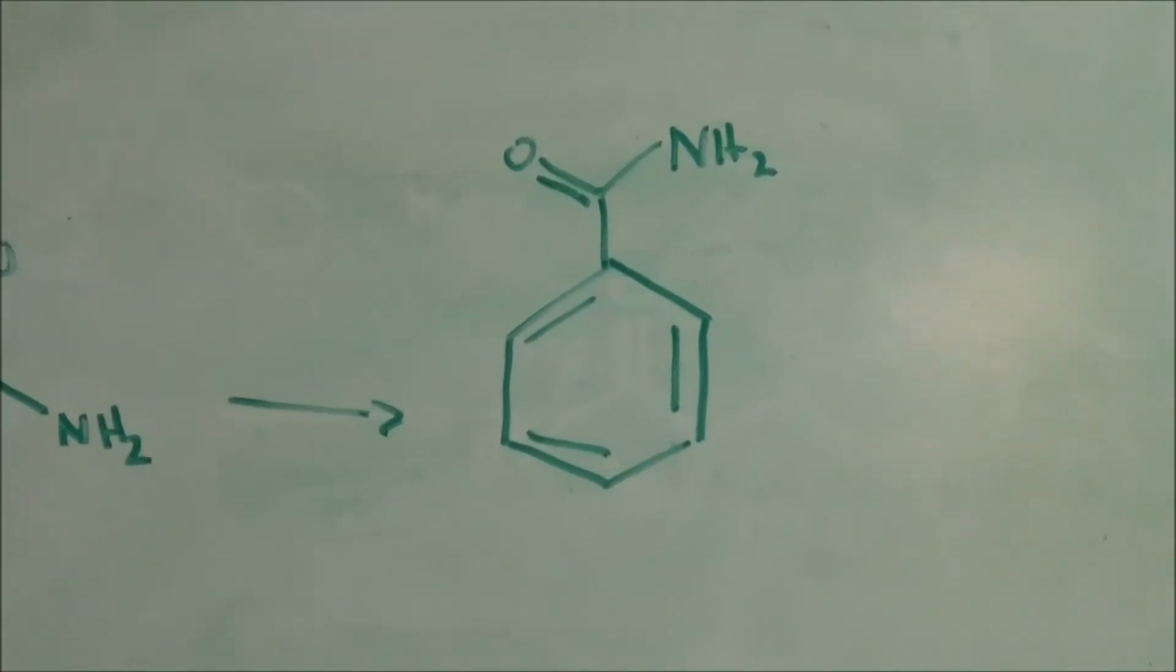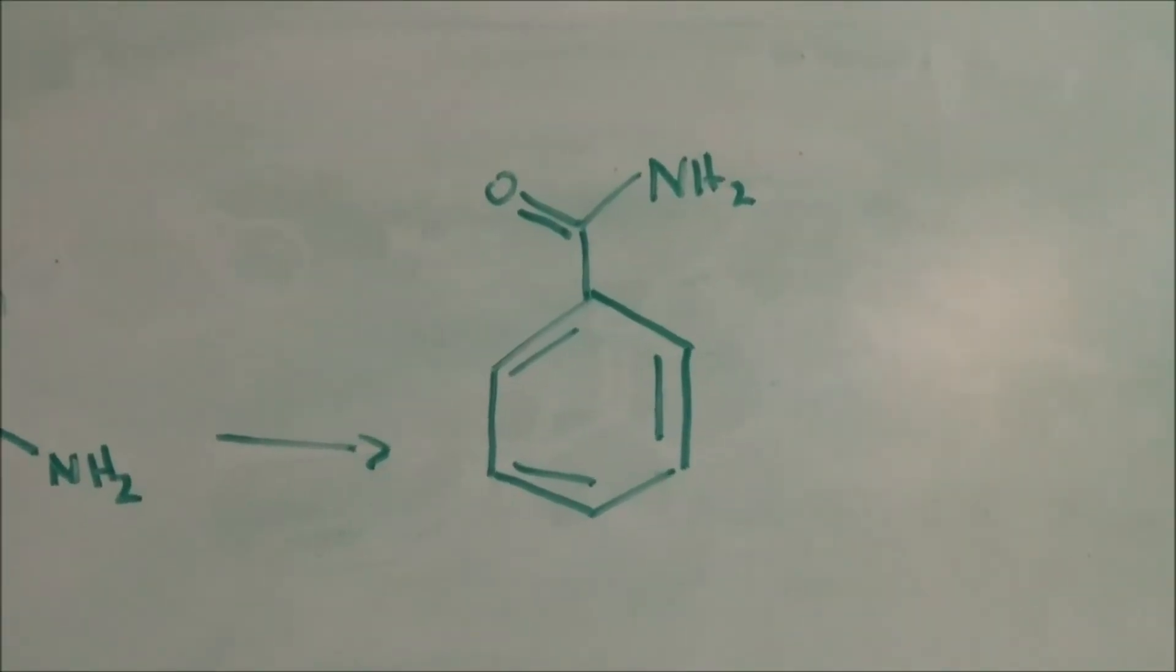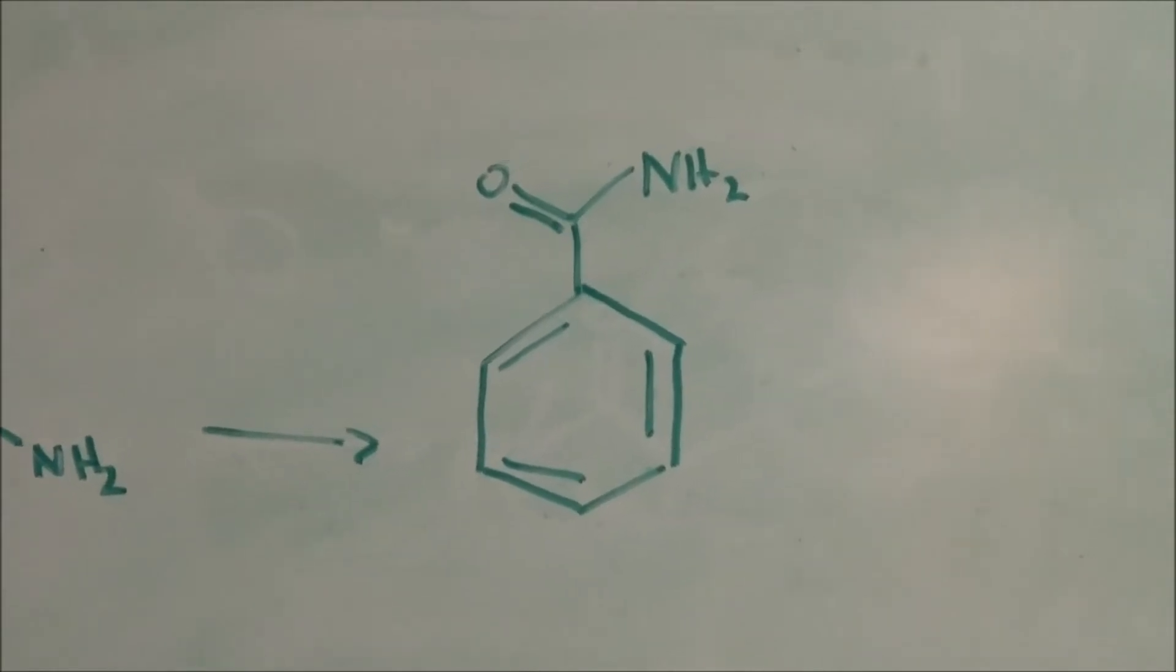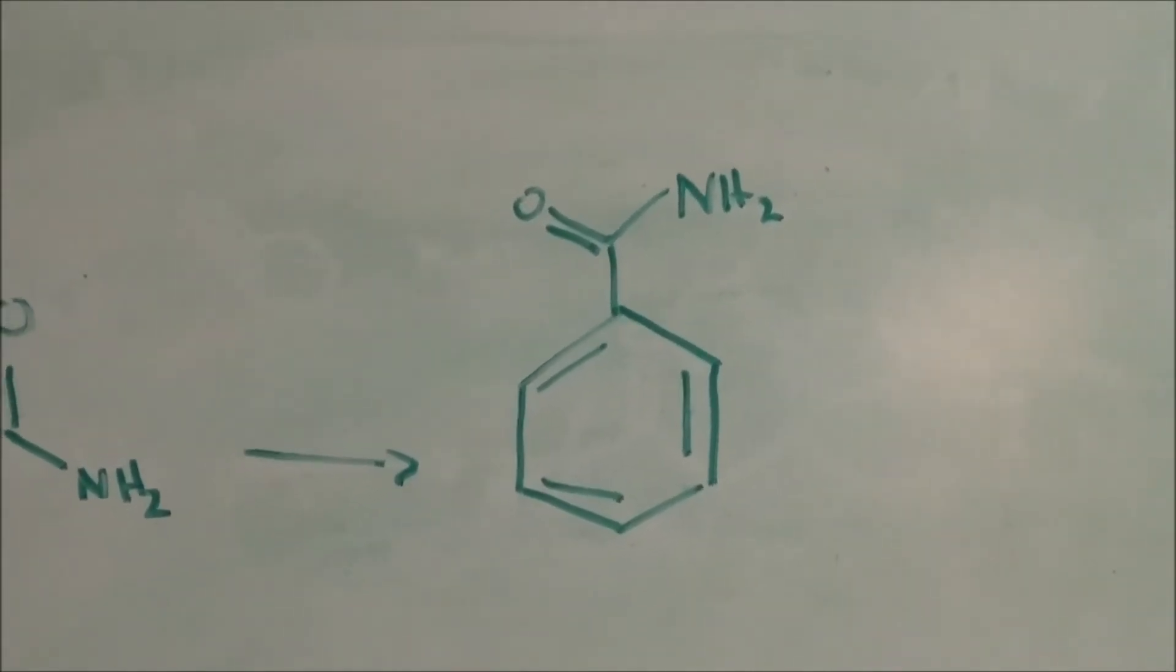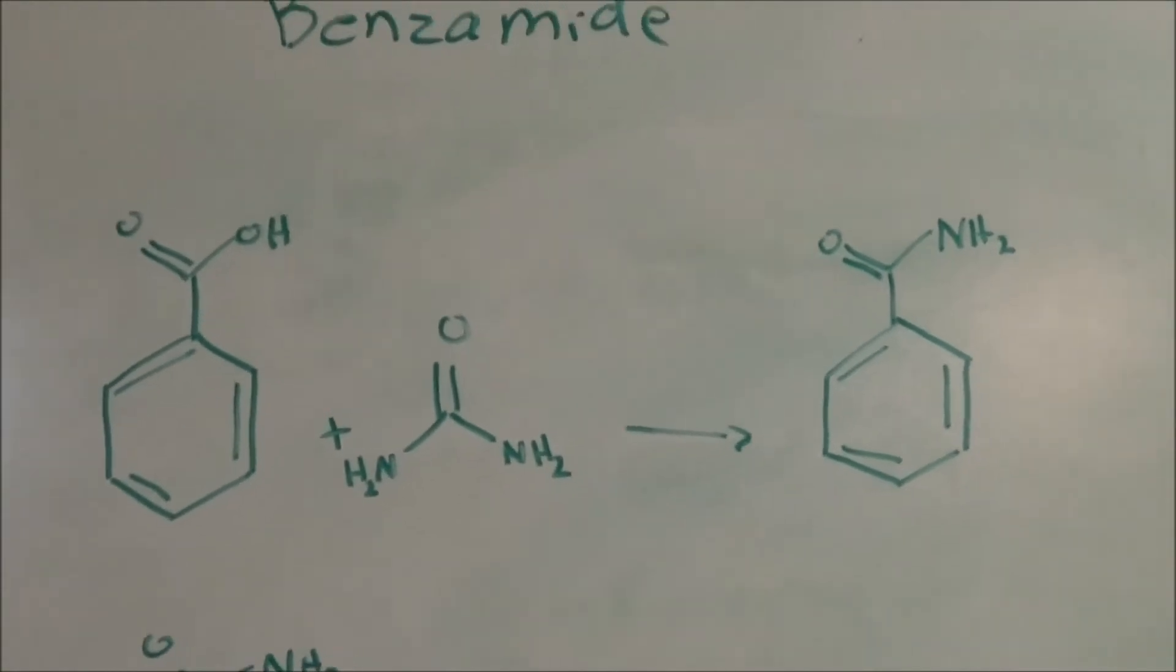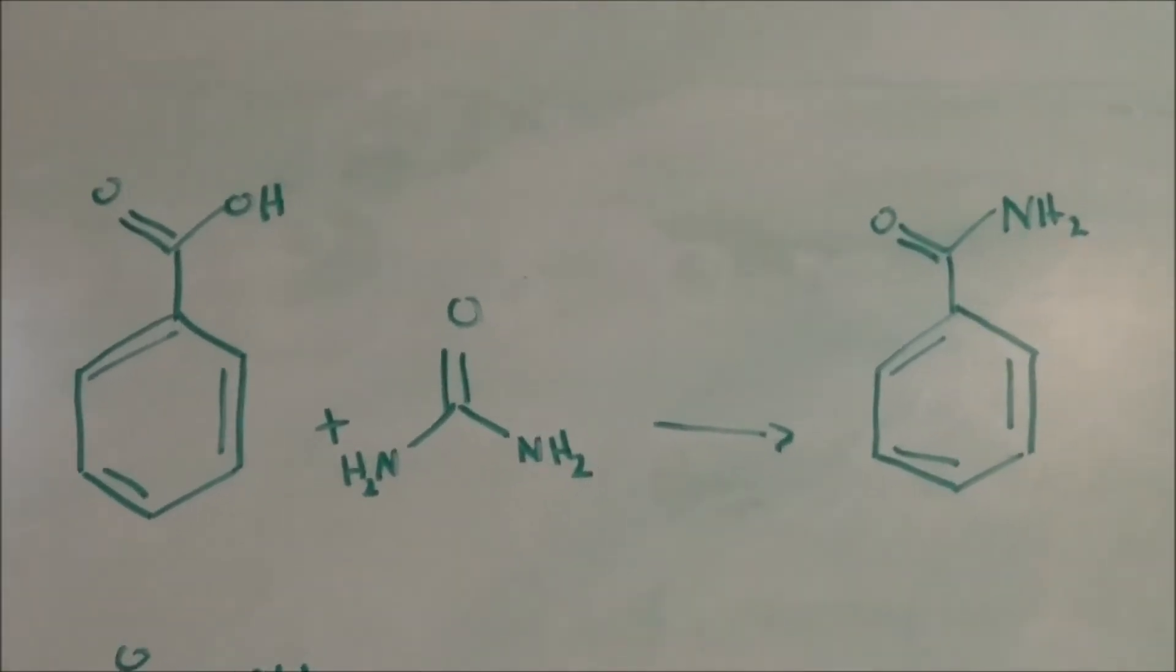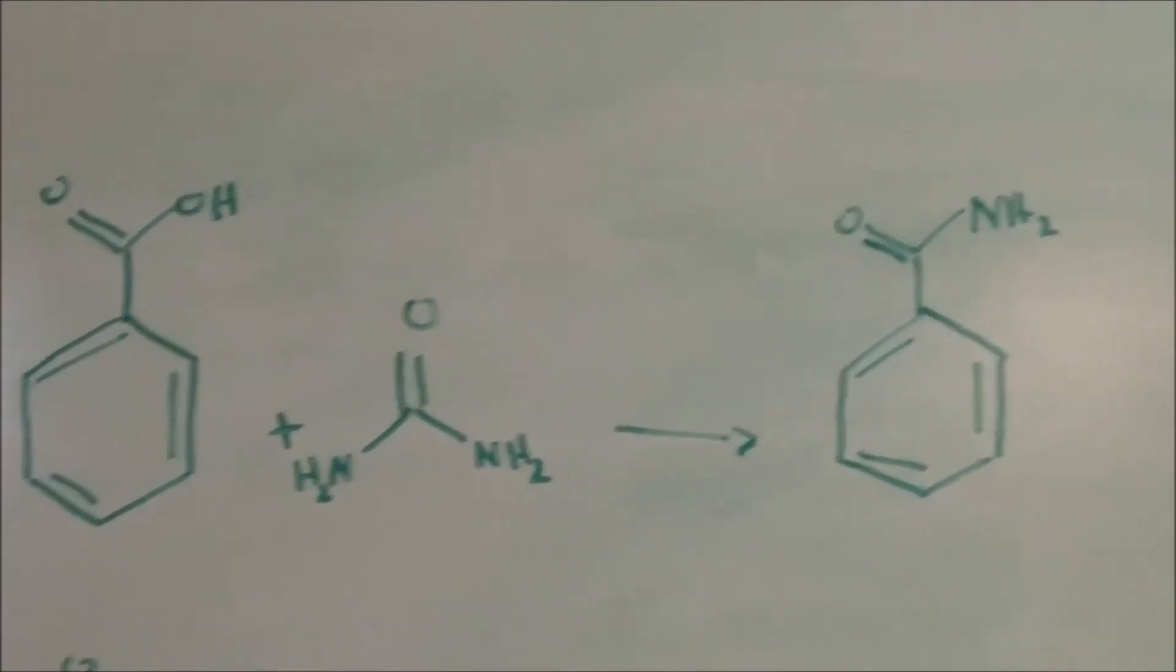Benzamide has been prepared from esters of benzoic acid and ammonia, as well as the reaction of benzoyl chloride with ammonia, but today I'll react benzoic acid and urea with a boric acid catalyst to make benzamide.